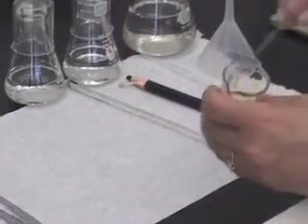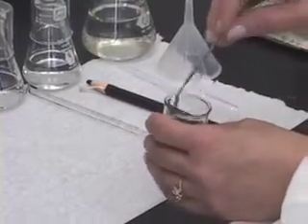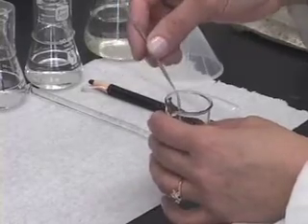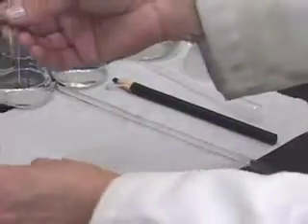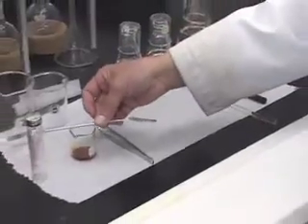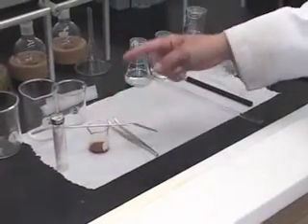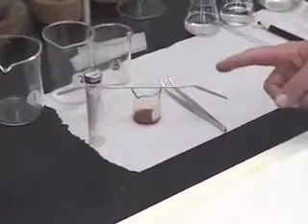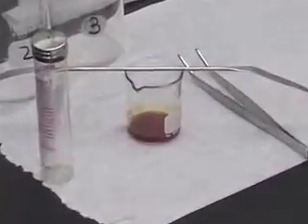Use a spatula, just mix it well and keep this aside for drying purposes. Because we are not going to add the sample as a solution to our column, but we are going to add it as a dry powder.